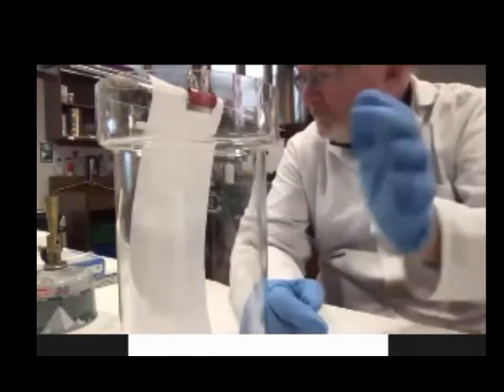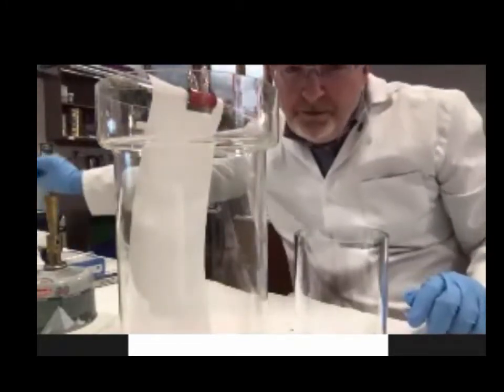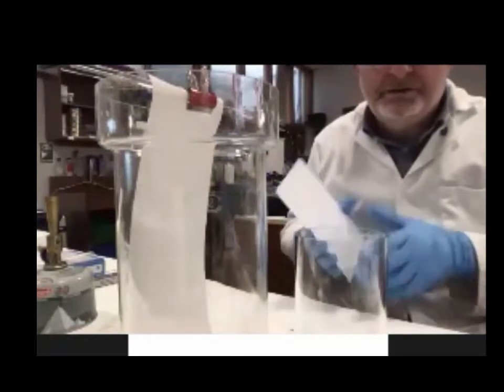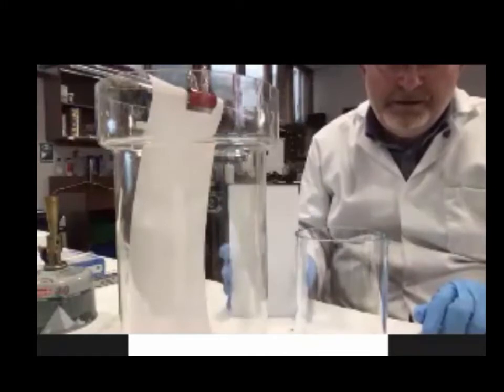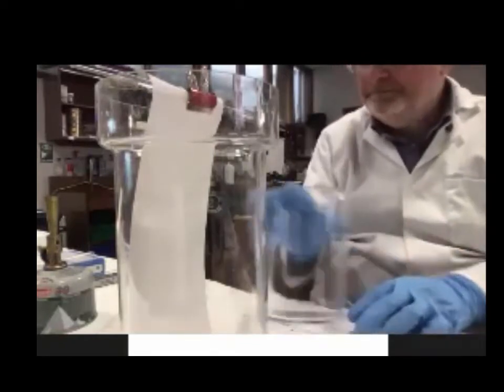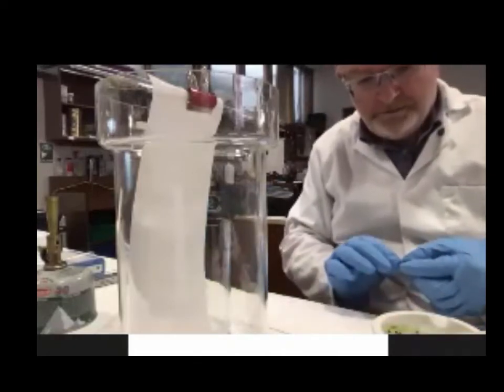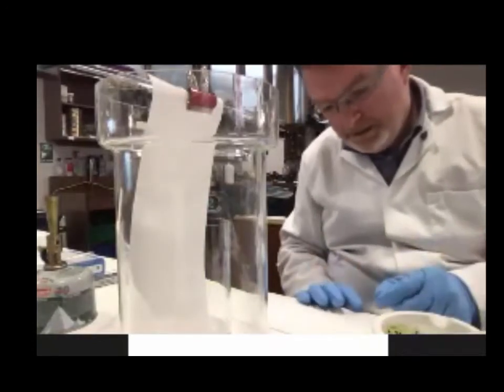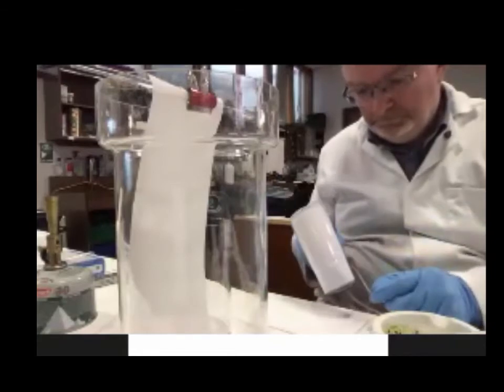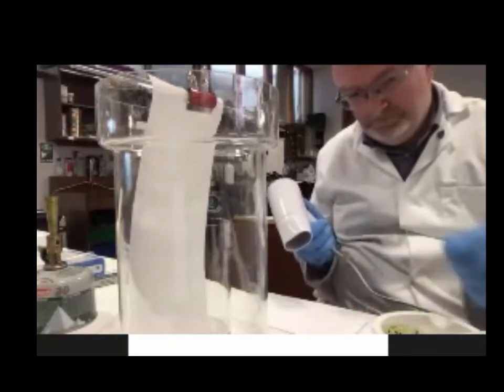All right. Next thing then is going to be thin layer chromatography. Have you done thin layer chromatography before? You probably did HPLC and all of that, but you're not going to do that in school. So this is, instead of chromatography paper, a glass plate, and it's coated with silica gel. And again, we can do the same thing actually. We can take exactly the same, okay, and we can just spot that on there. Exactly the same.